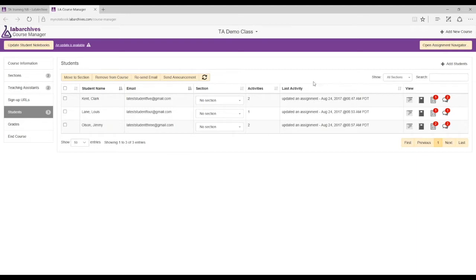Look at the View column on the right-hand side of the Students tab. There are icons there — move your mouse up to where it says 'Show.' It probably says something like 'show my section.' Change that to show all sections, and then go back down to the Grades tab on the left. If your instructor doesn't put you in a section, this is exactly what happens — you need to change the view to show all sections in order to see the students and their grades.